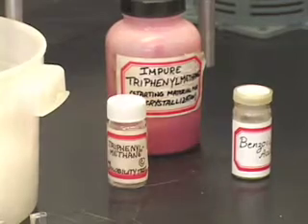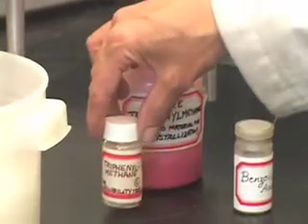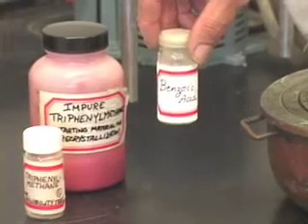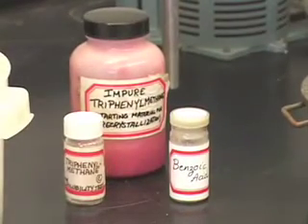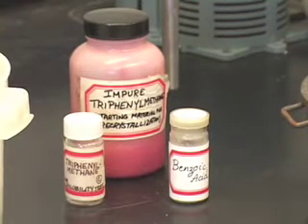Now, what I am going to do is demonstrate this selection of the solvent for recrystallization. However, I am not going to use this standard triphenylmethane. I am just going to use another compound. I am just going to use benzoic acid and demonstrate this selection of the suitable solvent for recrystallization. The reason being, I would like you to figure out the right solvent for recrystallizing impure triphenylmethane.